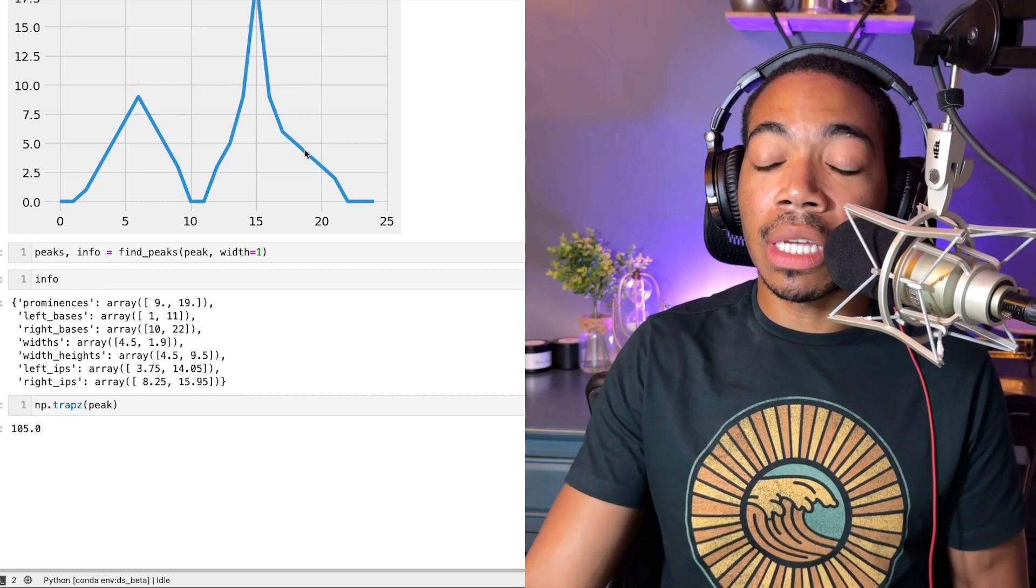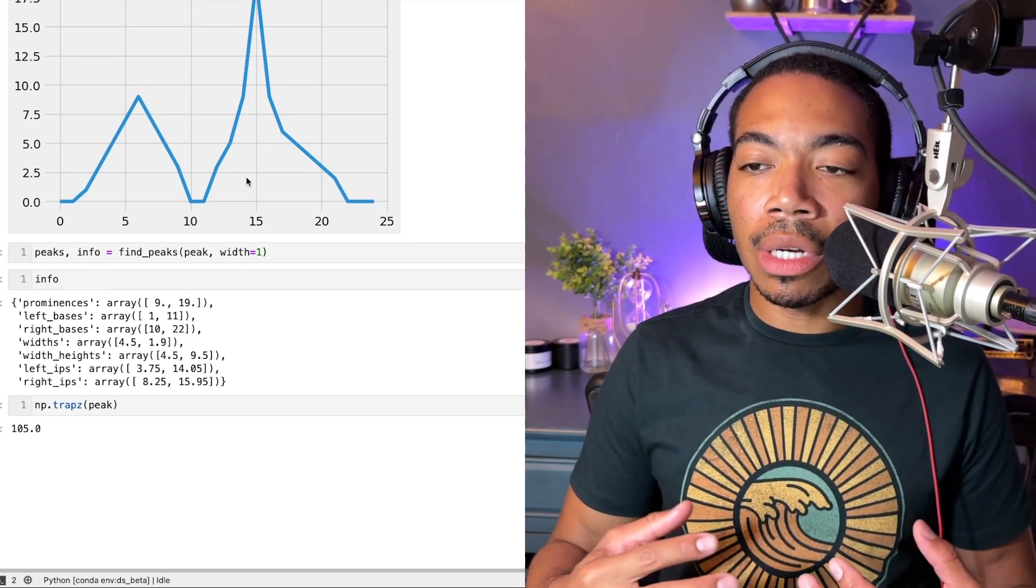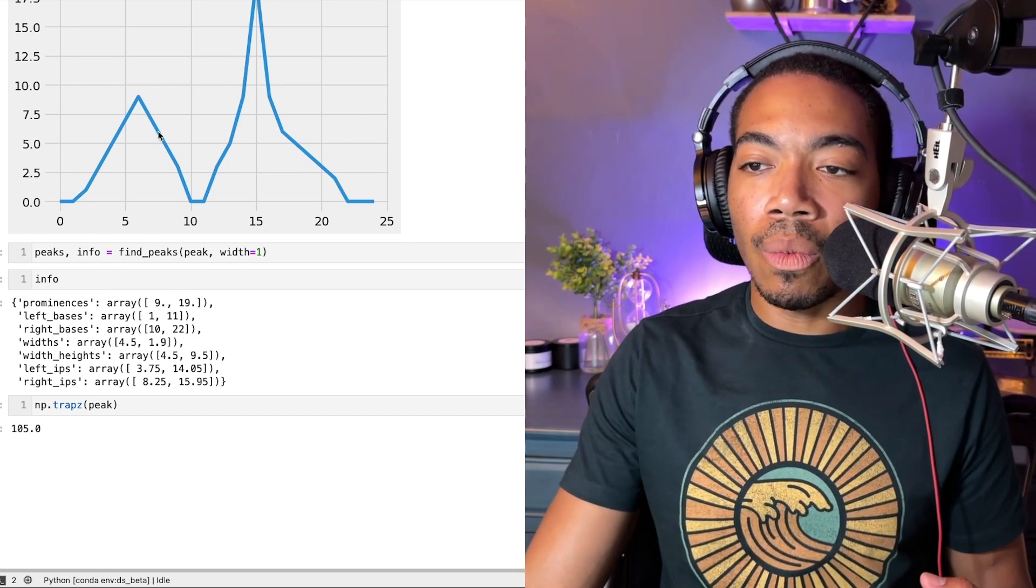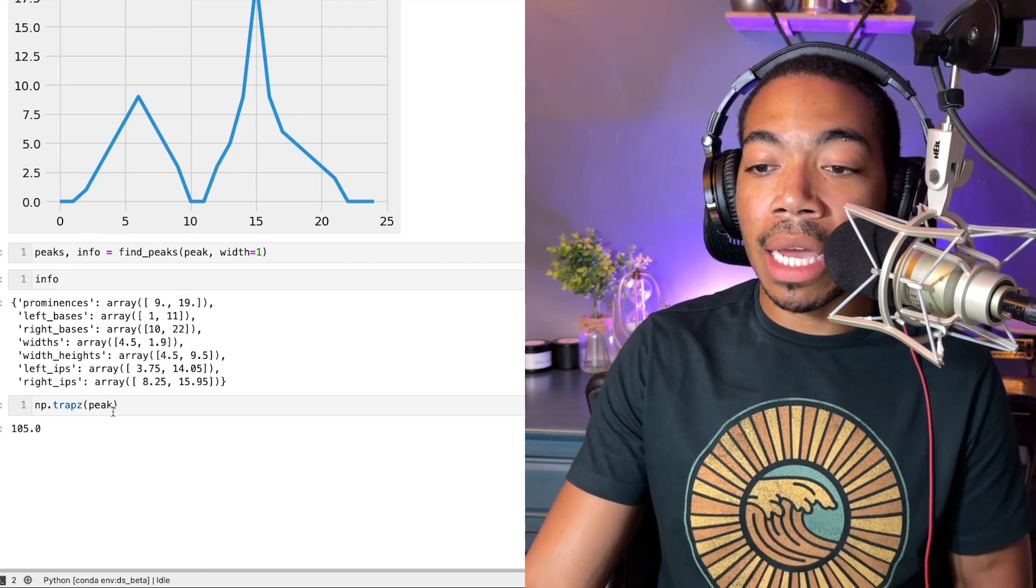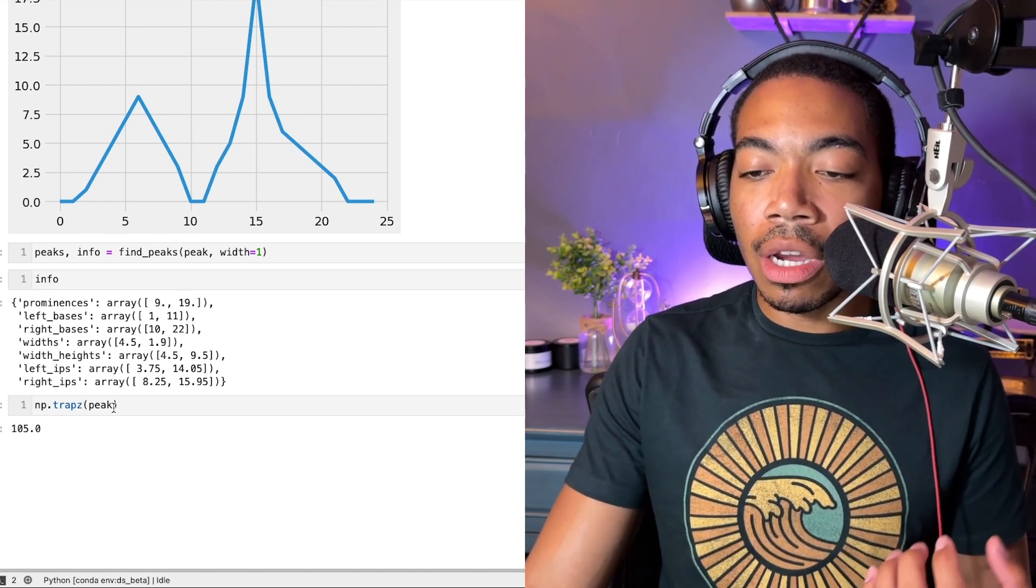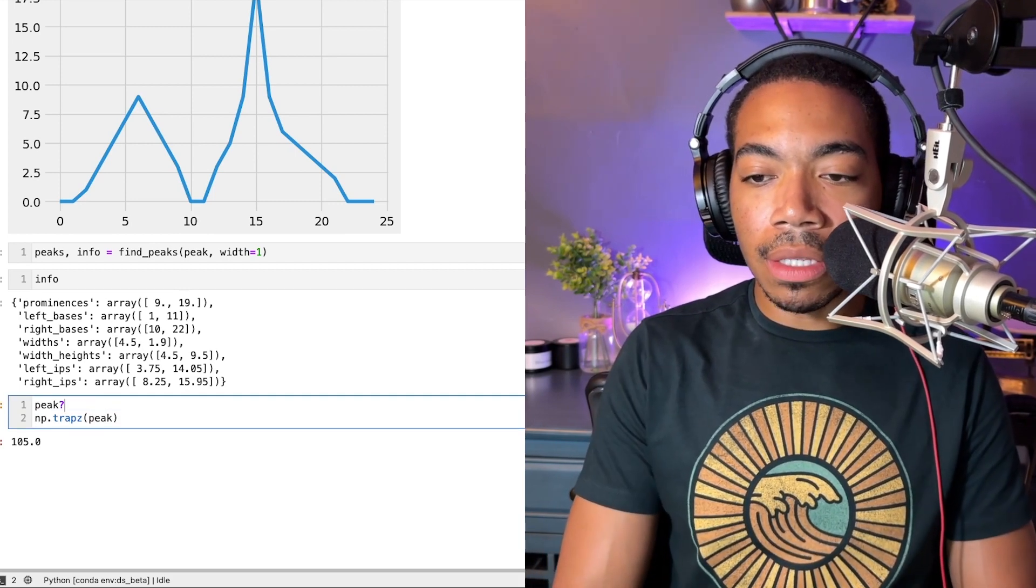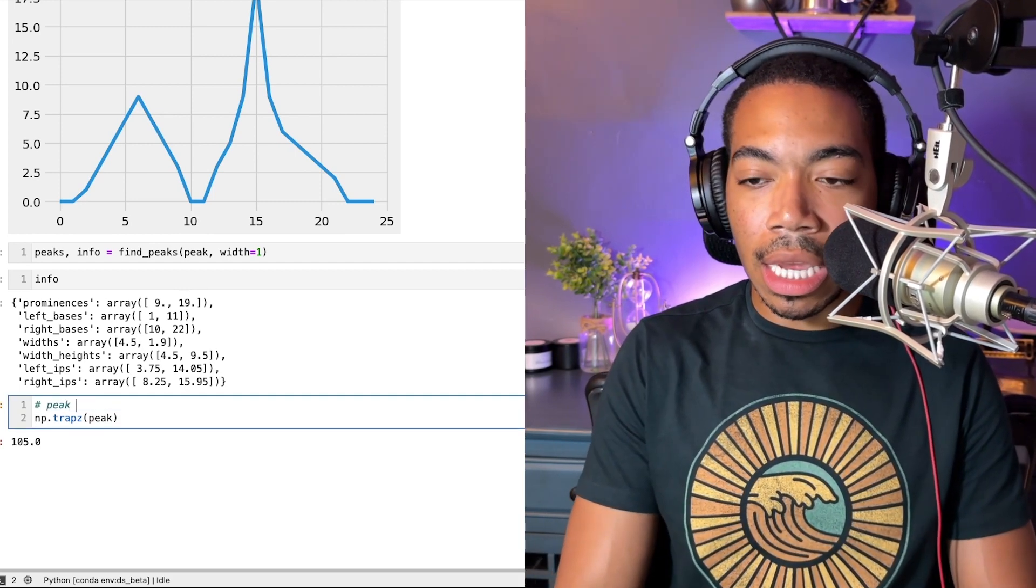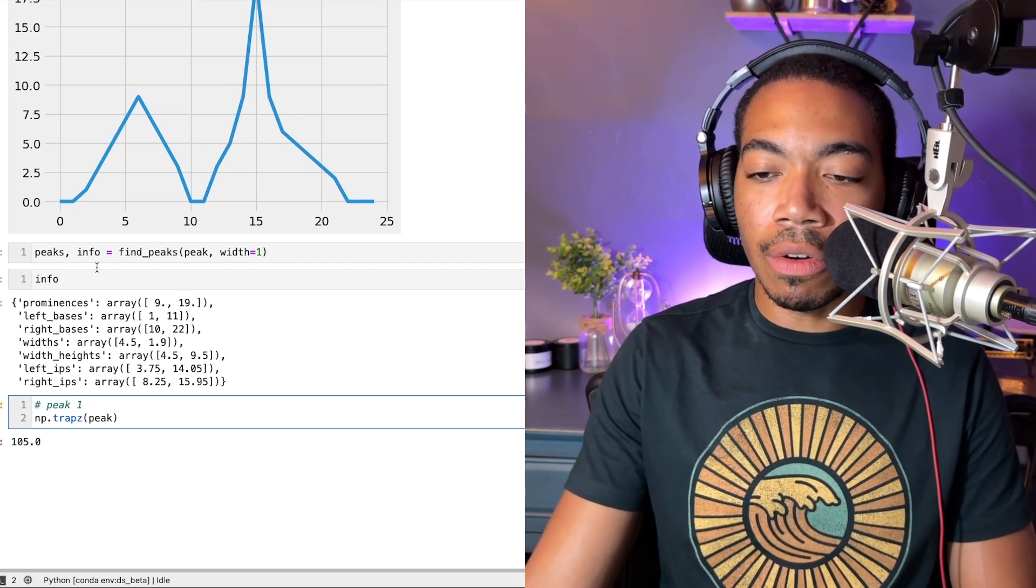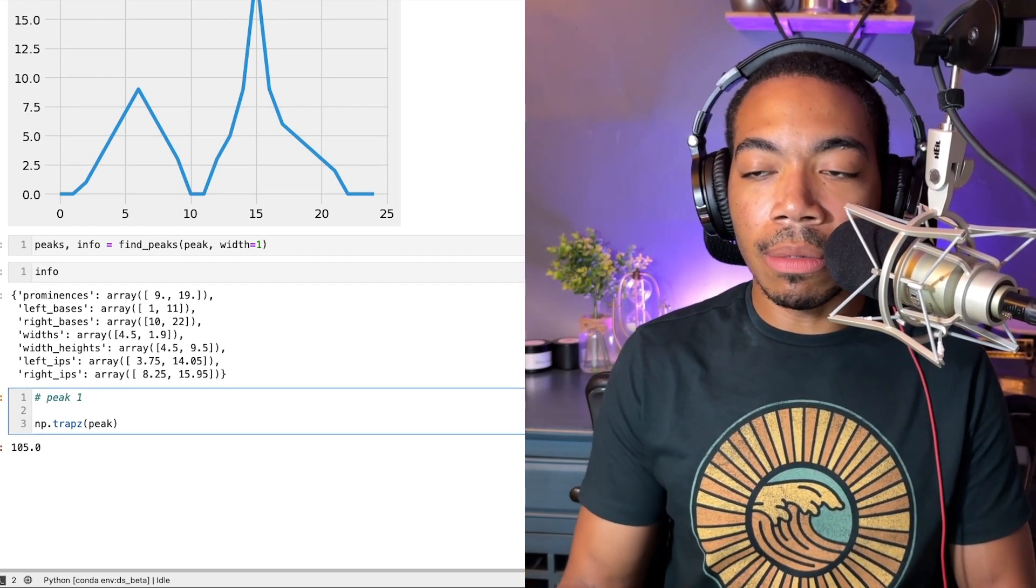Now I want to demonstrate how we can identify where these peaks are located and just pass the specific peak information for one of these peaks, then replicate that for the second peak. Let's just indicate we're looking at peak one, which would be the first peak here.